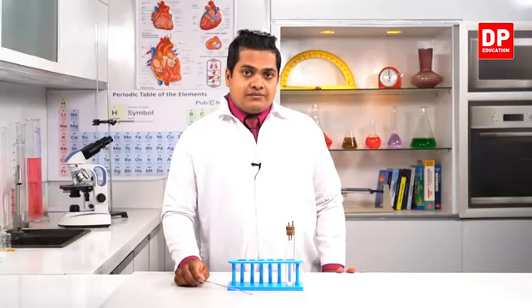First and foremost, these boiling tubes should be identical to each other in all aspects. I mean their radius should be equal to each other, their width should be equal, and they should be of the same volume for sure.